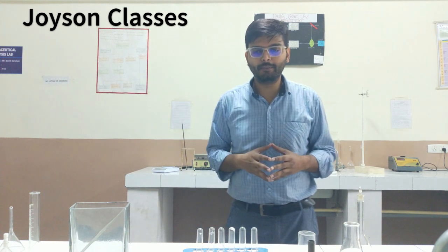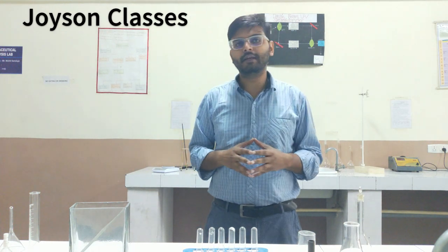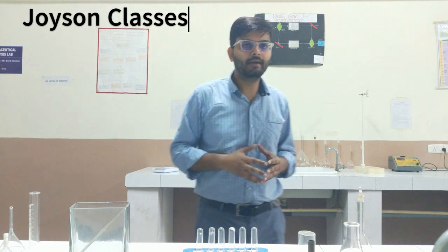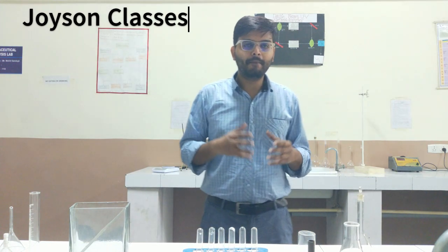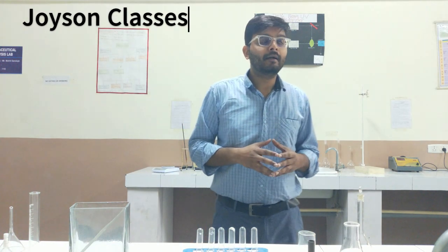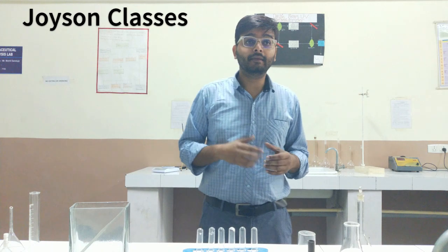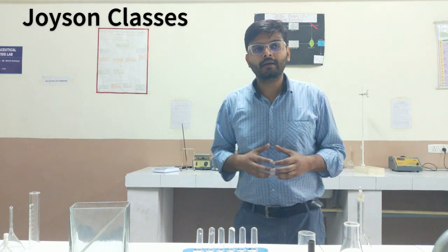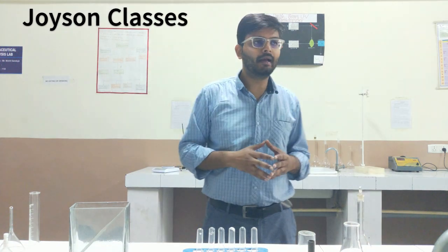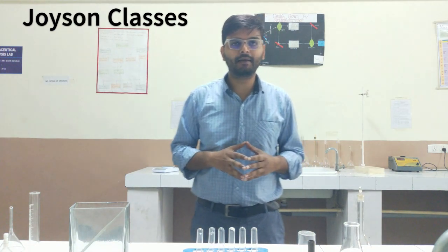So this would be a correct time to tell you about the various glasswares used in the pharma analysis laboratory, because some or most of them will be used in the coming years in the organic chemistry lab, medicinal chemistry lab, and various other labs.